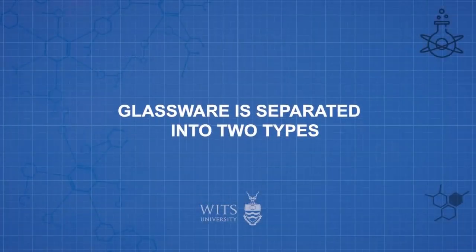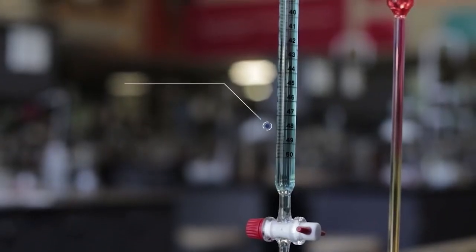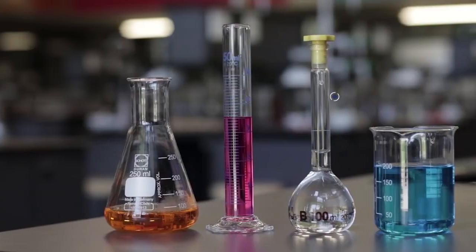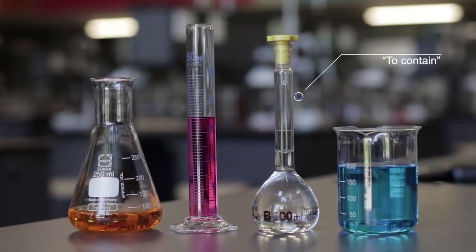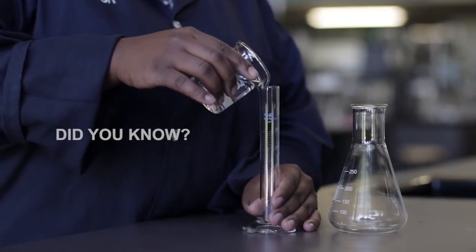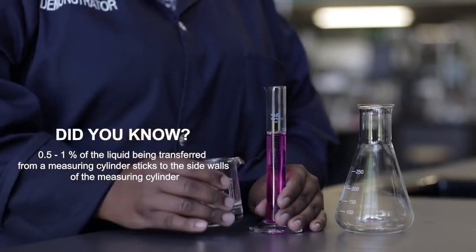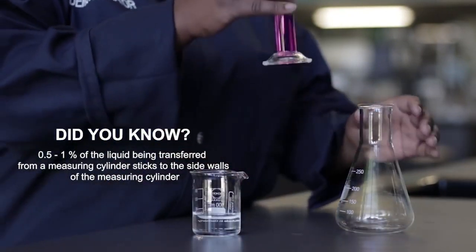Glassware is generally separated into two types, to contain and to deliver. To contain glassware refers to glassware that is used to contain a certain amount of volume. It is designed to contain liquids, but when transferring liquids, it delivers less than the indicated volume due to the liquids clinging to the sides.